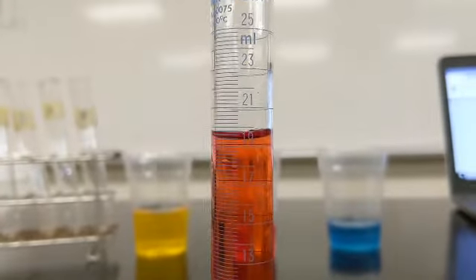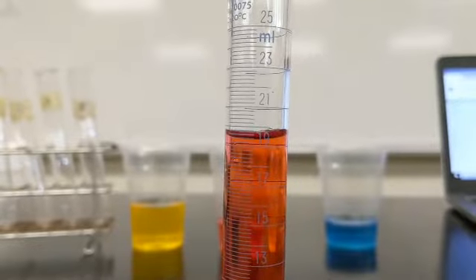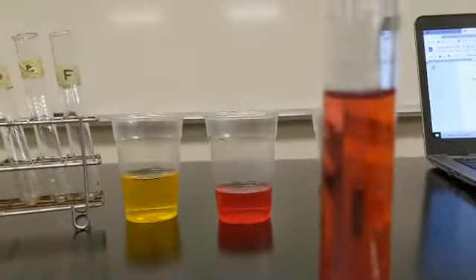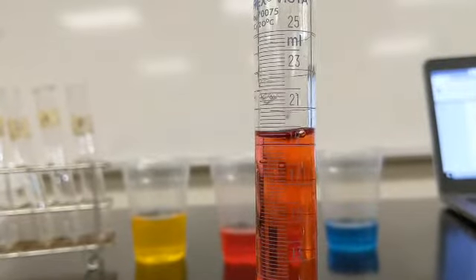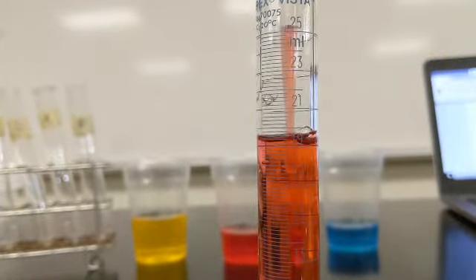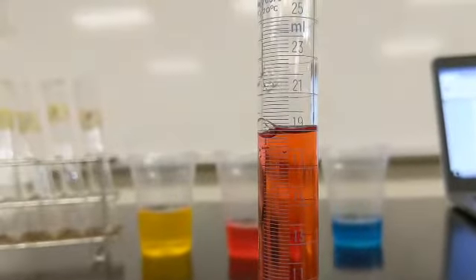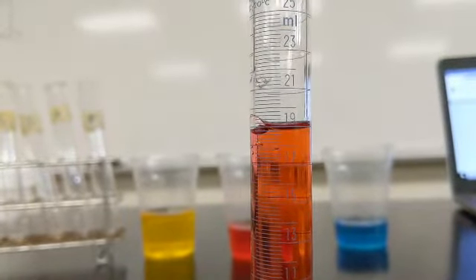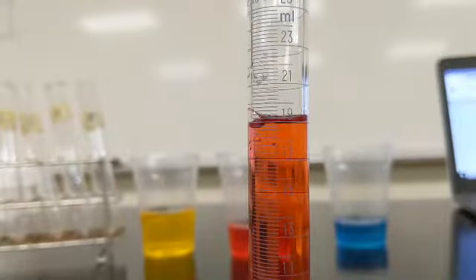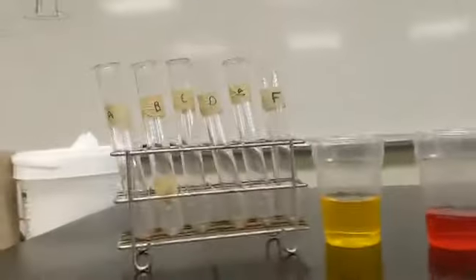Okay, so if we are measuring from the bottom of that curved surface, that meniscus, it looks like I poured in a little bit too much of the red. So now I'm going to take the pipette and take some out to get a nice, accurate 19 milliliters. All right, I need to put a drop back in. There, let's call that 19, okay? So pour that into test tube A.